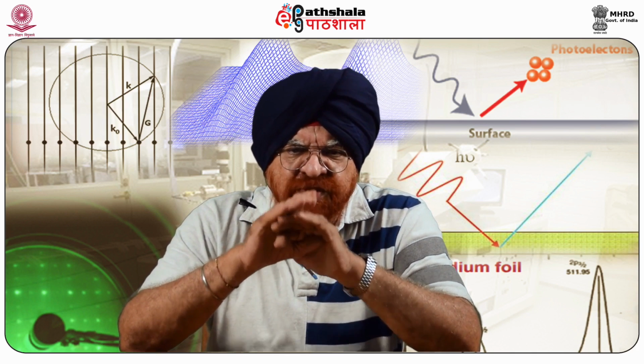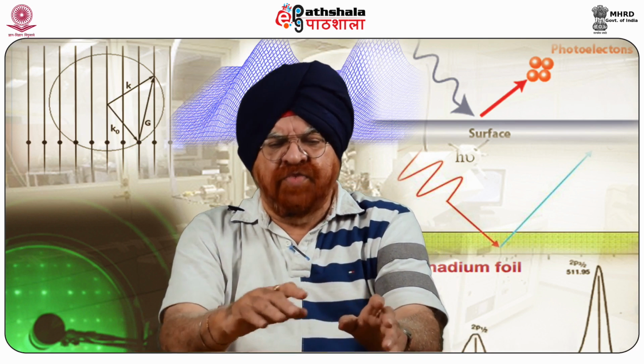A typical XPS spectrum is a plot of the number of electrons detected, sometimes per unit time. That is plotted on the y-axis, that is the ordinate, versus the binding energy of the electrons detected, which is plotted on the x-axis, that is the abscissa, as we call it in coordinate geometry.